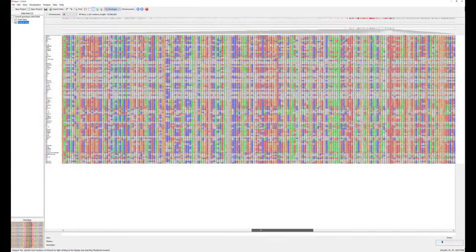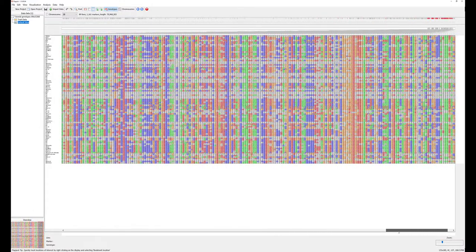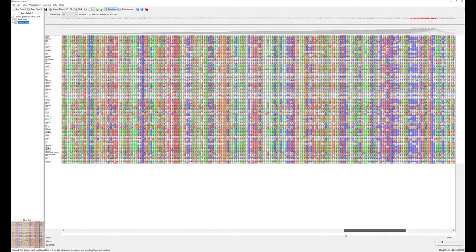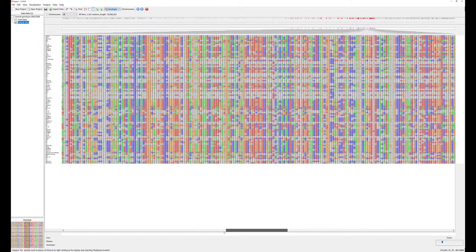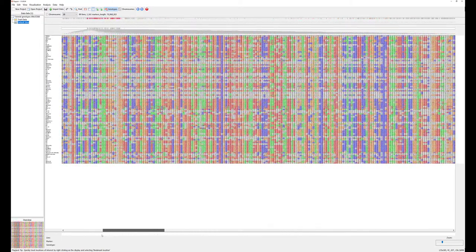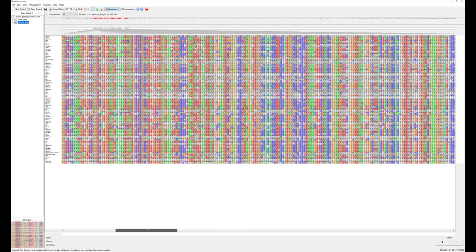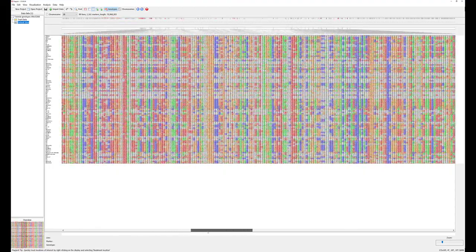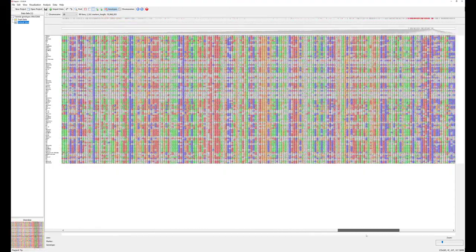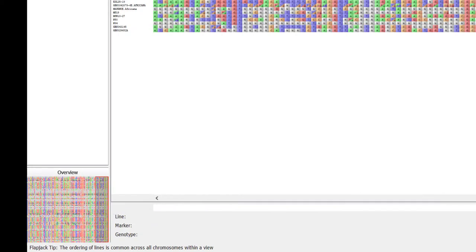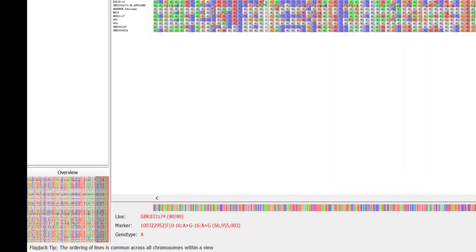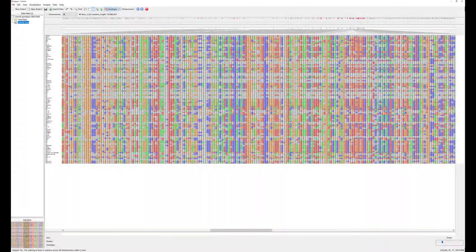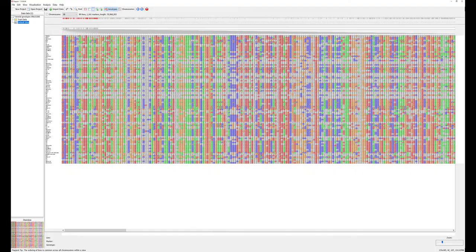Using the scroll bar at the bottom of the Flapjack window allows for navigation along the selected chromosome and note the distribution of markers visible on the screen can be viewed below the chromosome layout above the genotype data. Line, marker and genotype is displayed at the bottom of the Flapjack window as the mouse is placed over the genotype data. The overview window displays the full chromosome view.